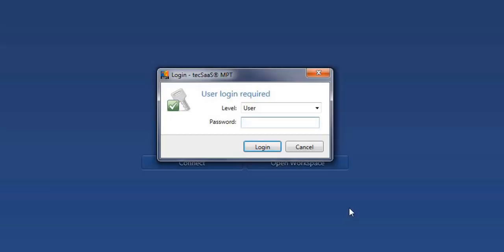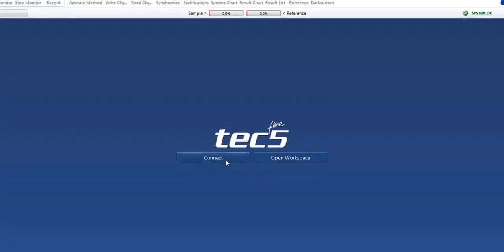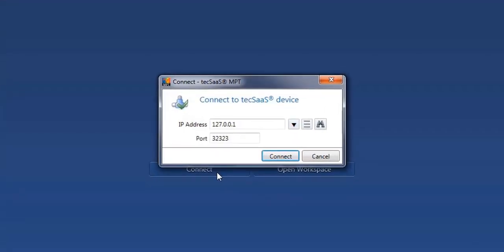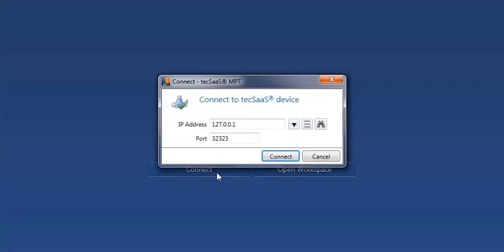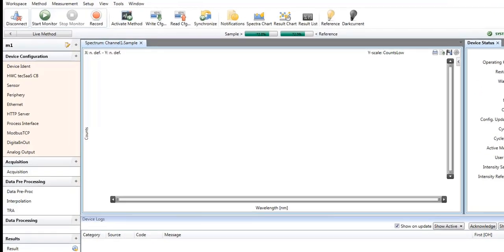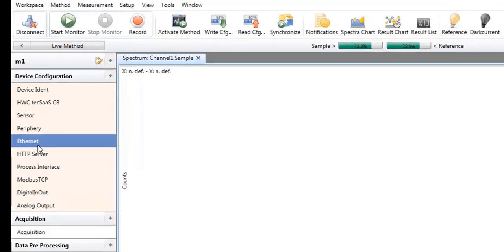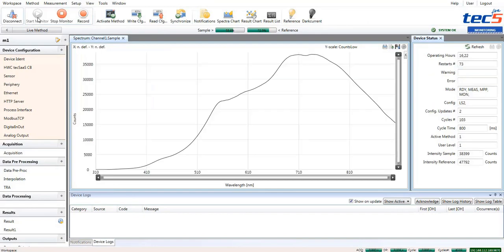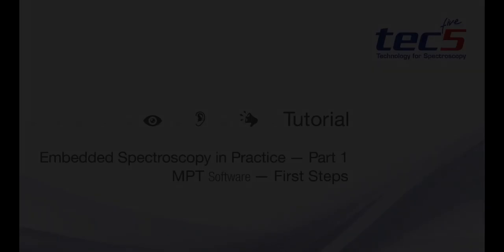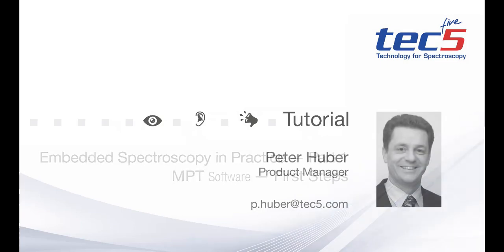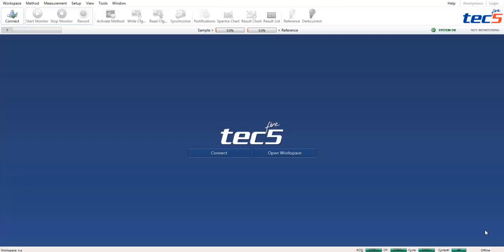Which are the first steps to start the operation of a TEXAS embedded spectrometer system with the MPT software? Welcome to an introduction to the TEXAS Monitoring and Parameterization Tool.